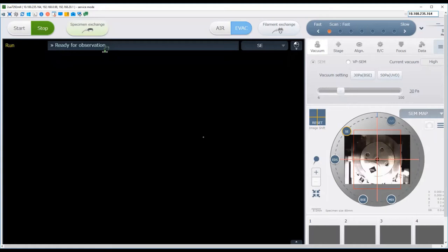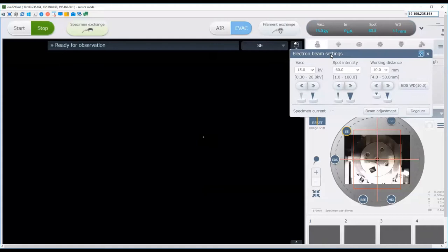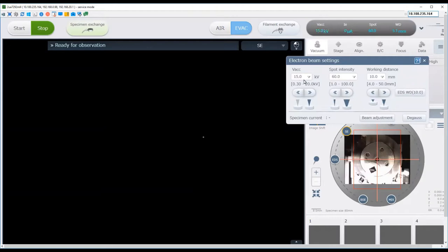Once the software indicates it is ready for observation and you hear the instrument beep, you are now ready to power up the electron beam. First, check the settings by coming to this panel and clicking the little arrow to pull down one of the four instrument panels. Select the one with the accelerating voltage. Click inside to bring out the E-beam settings dialogue, where you can set the accelerating voltage, spot intensity, and working distance.